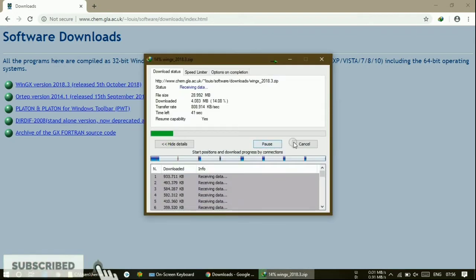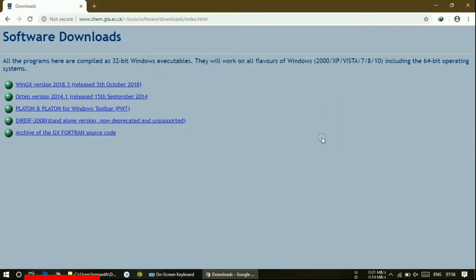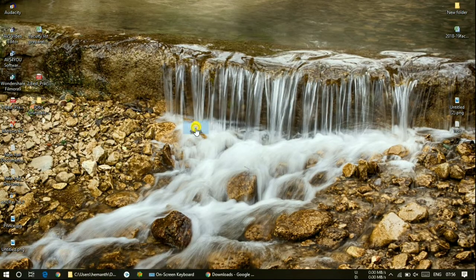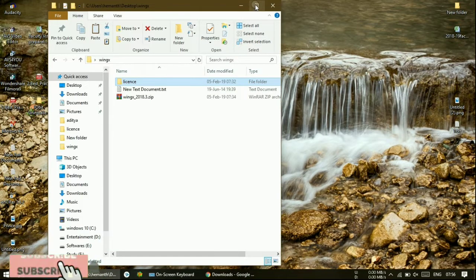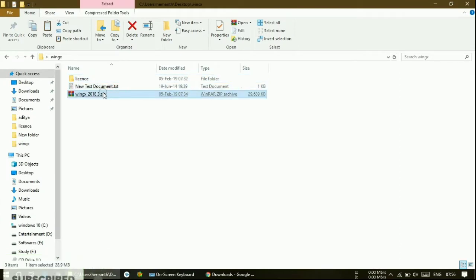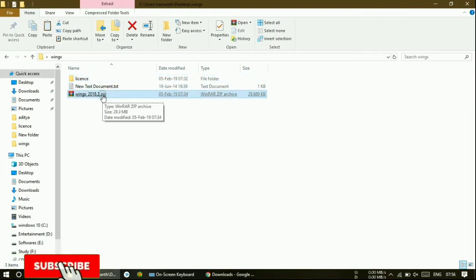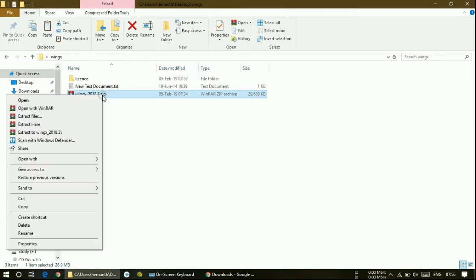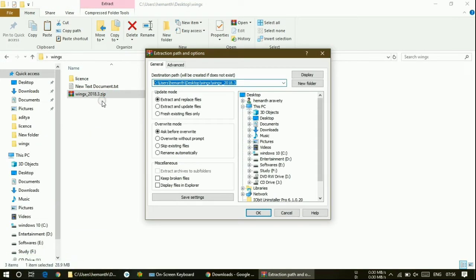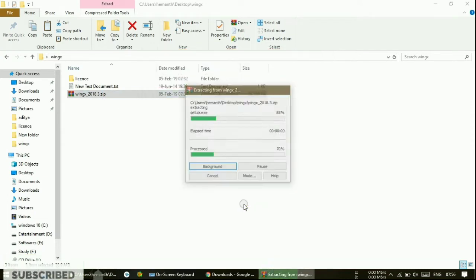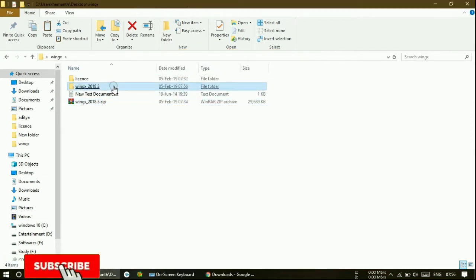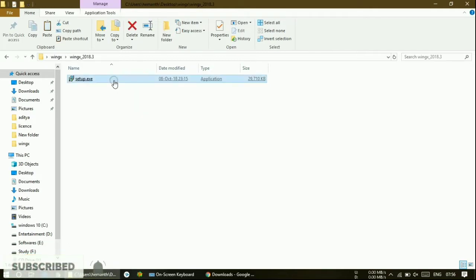Just minimize the browser. This is the file which I have shown. I have downloaded this earlier, so I am showing here. Just extract this — it will be downloaded in the form of a zip file. After extracting, you will get a folder like this. Here it is a setup file — just install this.